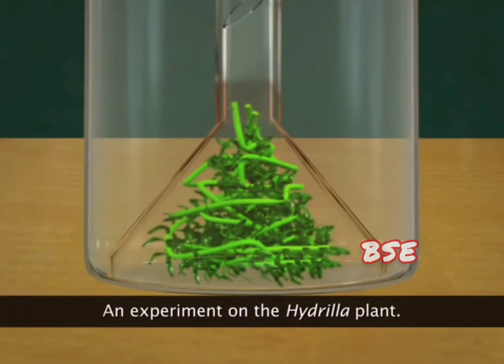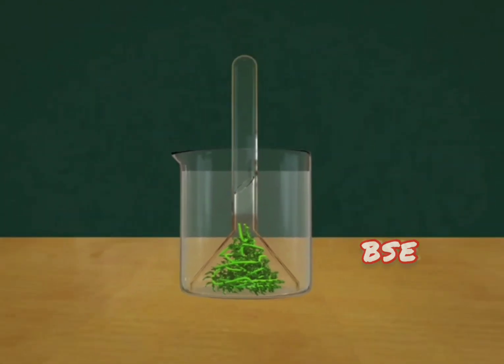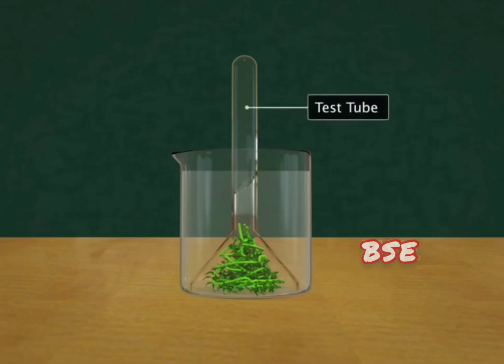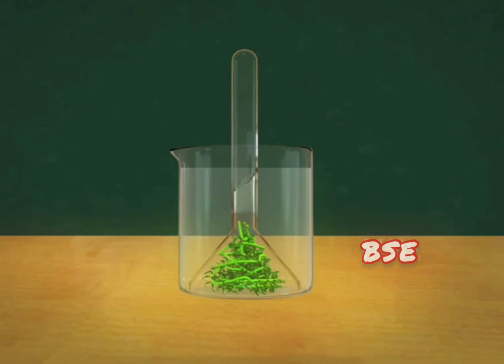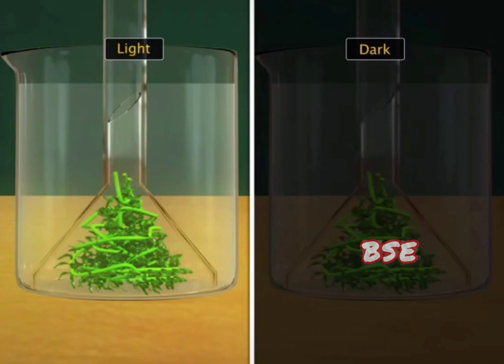Let's watch an experiment performed on a hydrilla plant. The hydrilla plant is kept in a beaker filled with water. A funnel is placed over it. A test tube is inverted over the stem of the funnel. Let's keep this setup in two different conditions, in light and in dark.